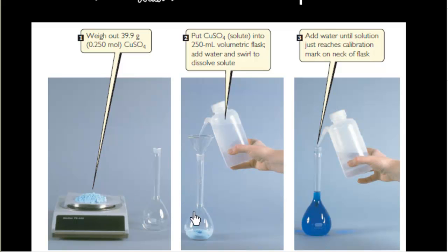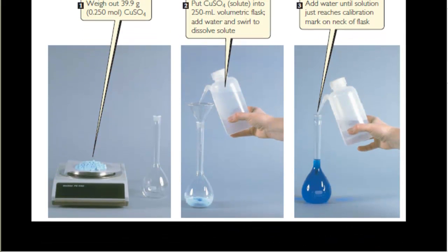This is the weighing machine digital balance. We can weigh this one and then put this into the volumetric flask. After putting this into the volumetric flask, add some water so that we can easily mix. Add some water, mix this one so that any reduction in volume due to the heat change can be minimized.